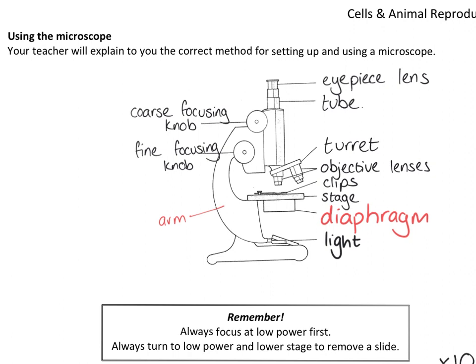And then I'm going to do another quick recap on how we view an image using a microscope and how we prepare a slide, all of which we did before Christmas, but we're going to do them with a couple of different examples and just to remind you of those processes.